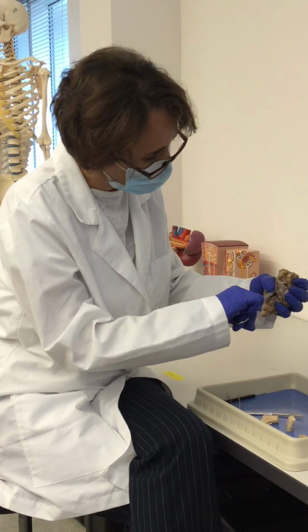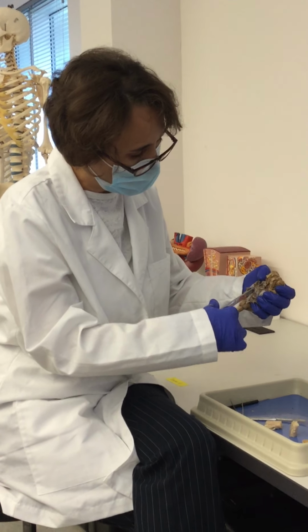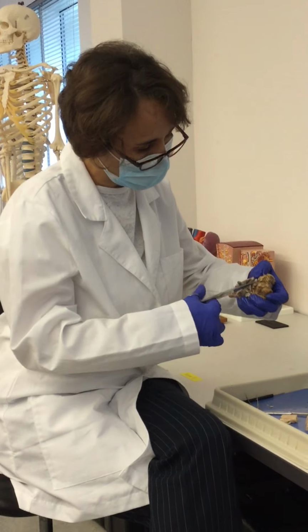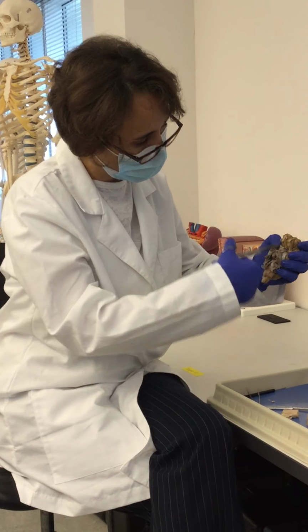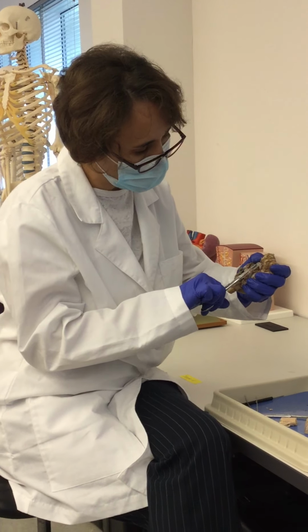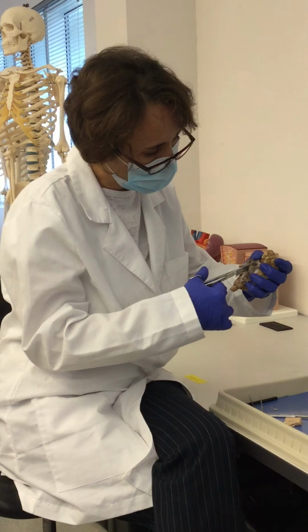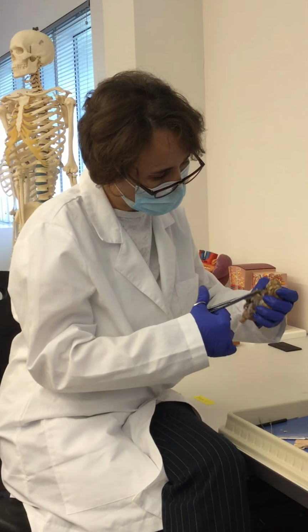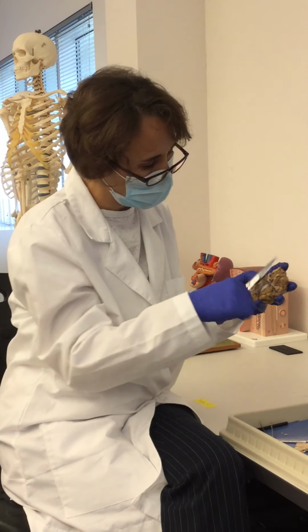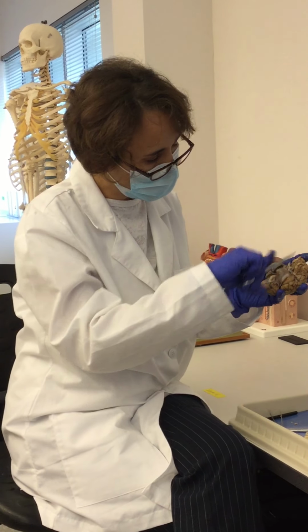So I reach here into this part where we have the optic nerves, cranial nerve number 2. In here, what I did was a horizontal, or transverse, section, and then I'm trying to go underneath and separate it from the optic nerves. The optic nerves run between the retina and the optic chiasma; they enter into the brain and make this crossing that is called the optic chiasma.